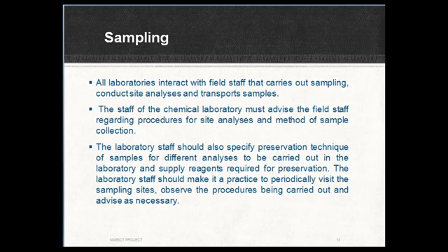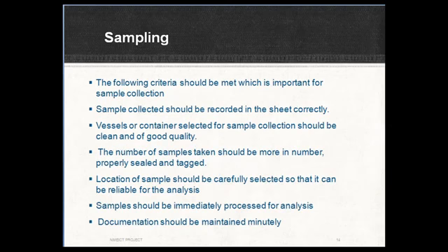The laboratory staff should make it a practice to periodically visit the sampling sites, observe the procedures being carried out and advise as necessary. Proper sampling procedures are an important first step in ensuring monitoring results.